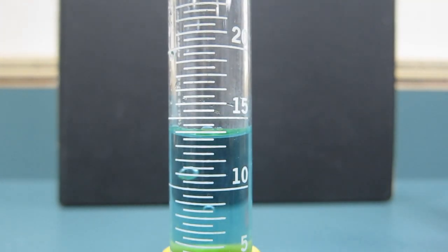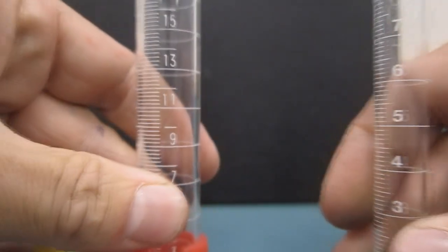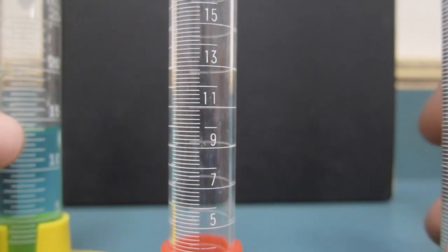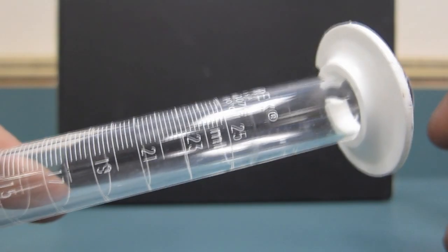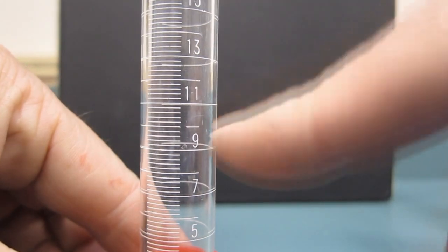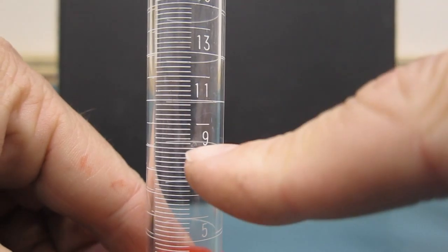I think I have more of these right here that I'm showing. These actually go up to 25, but they're more accurate than the one I just showed you because instead of only having halves, this one's counting by, it looks like, tenths.